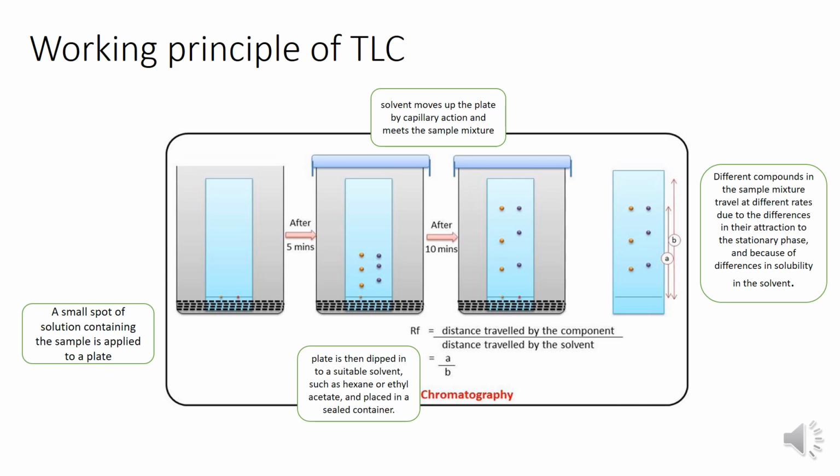As we see, the working principle is quite similar to paper chromatography, but why are we suggested to use TLC more? Because of some benefits, such as TLC has a faster run, better separation and a choice between different stationary phases.